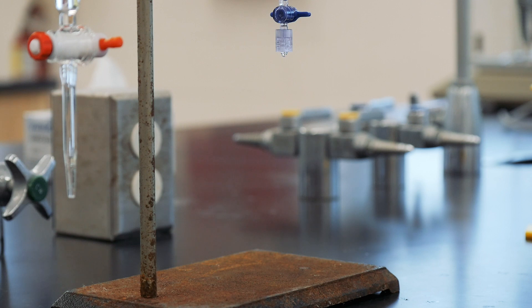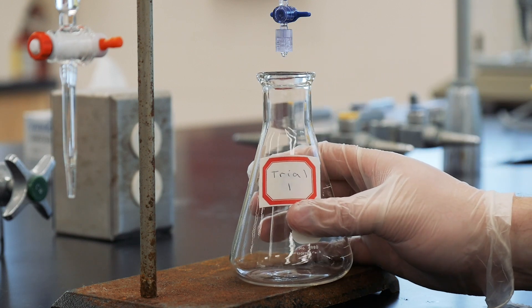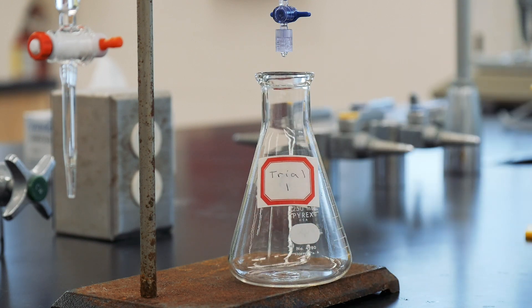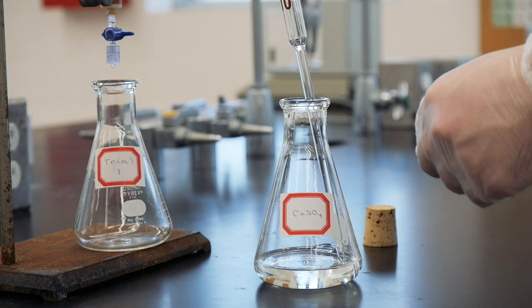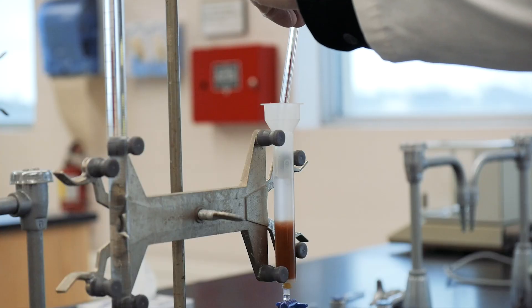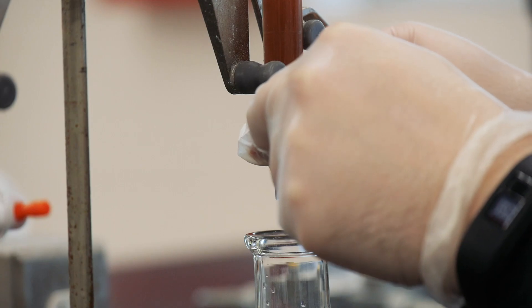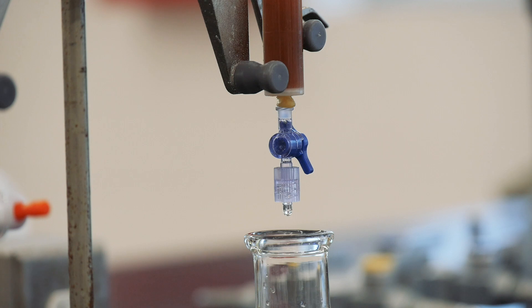Now that everything is set, we're ready to begin, so place a clean 250 mil Erlenmeyer flask beneath the column. Pipette 10 mils of your saturated calcium sulfate solution slowly onto the column. Collect it in your Erlenmeyer flask at a rate of about one drop per second.